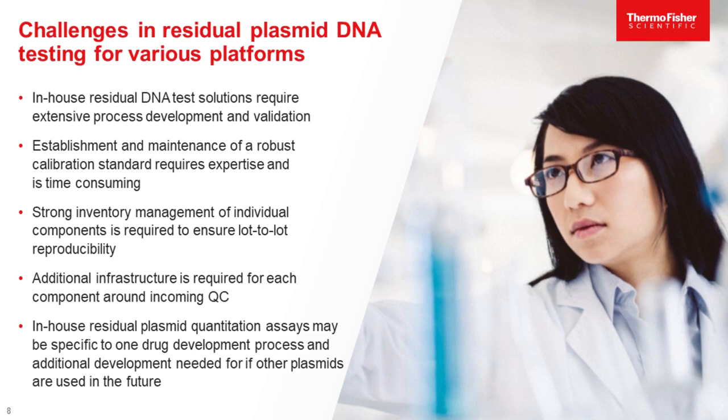In addition, there is a need to establish QC methods to ensure the assay kit is working reliably and to be able to maintain an inventory of such kits. In-house residual plasmid quantitation assays may be specific to one drug development process, and often additional development is needed when other plasmids may be used in the future.